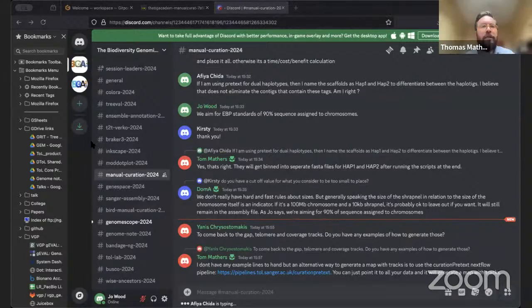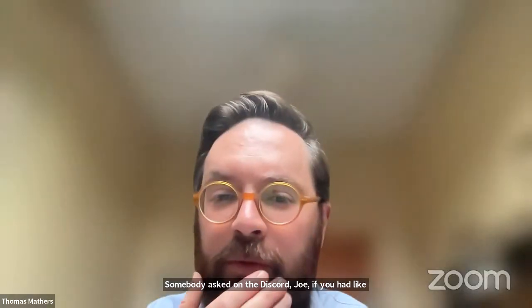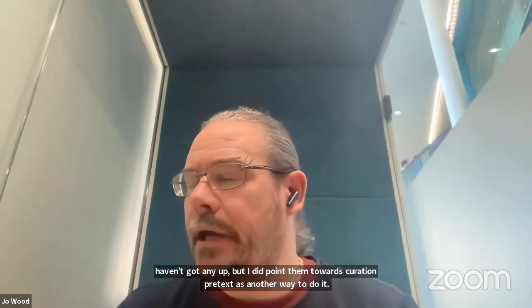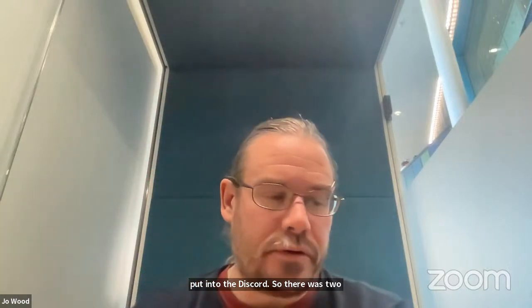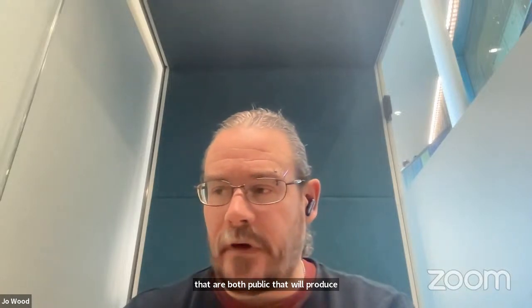I guess not. Somebody asked on the Discord, Joe, if you had examples for generating the track data. I haven't got any yet, but I did point them towards Curation pretext as another way to do it. But we can point out how to generate some of these, and I'll put into the Discord. So there are 2 pipelines available that are both public that will produce all of the necessary files.